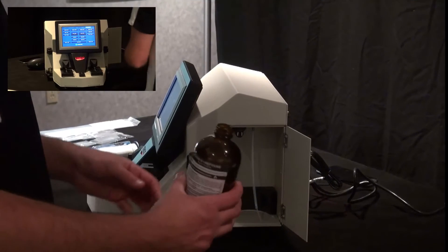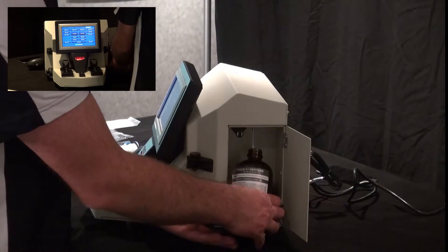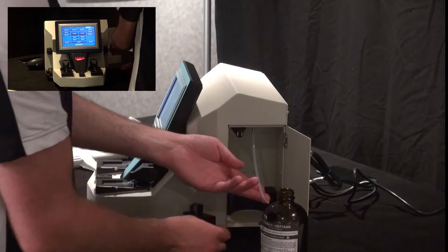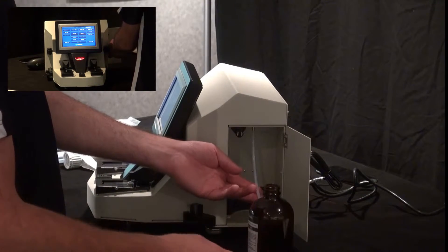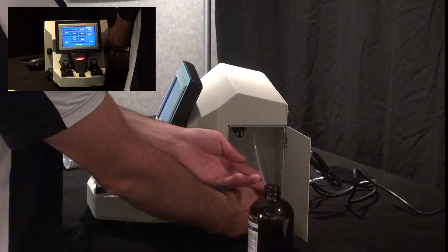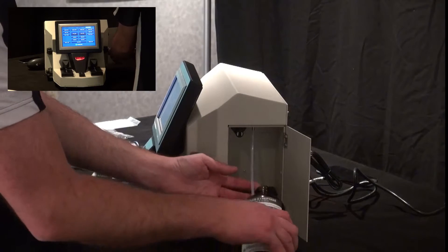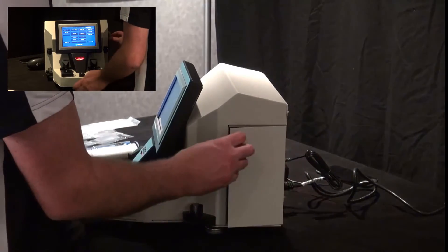Take your heptane bottle and insert the Teflon tubing into it. Make sure the label is facing out because there are two sensors inside that will tell you the fluid level in the bottle. If it gets too low, the unit will stop and won't allow you to make a sample. Make sure the label is facing out so it doesn't confuse the sensors. Slide it in and close the door.